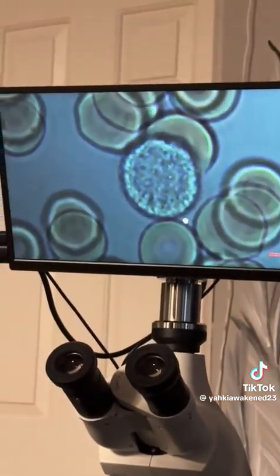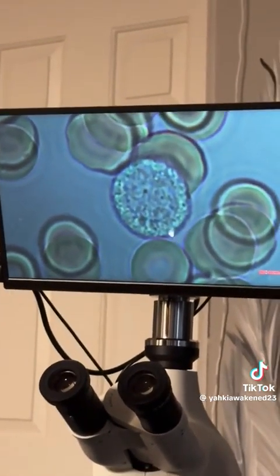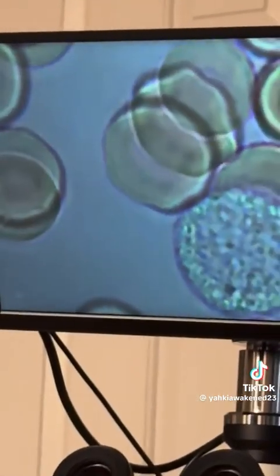Let's change it. I want to change it to dark field to see how it looks in dark field. You got to catch them too, because they be moving. That thing is eating. I see it in bright field. Look at that beautiful thing. That is amazing. Notice the parasite. Look at that parasite. They trying to stay away from that thing. They don't want no problem, because that's going to phagocytose and engulf anything that's around it.